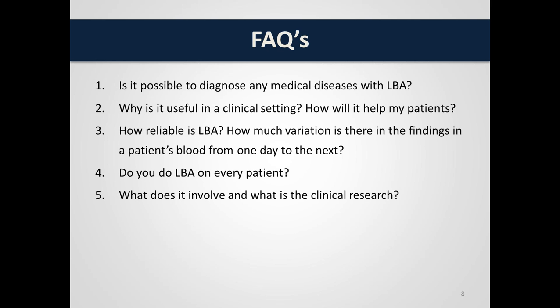All right, well, in terms of what it involves, it's basically a visual analysis conducted on 2 blood samples, a live sample and a dry sample. Now, the live blood part of the test involves looking at the live blood sample under high magnification using 2 different types of applications in microscopy, bright field and dark field.